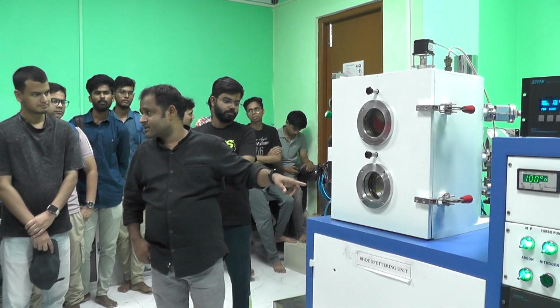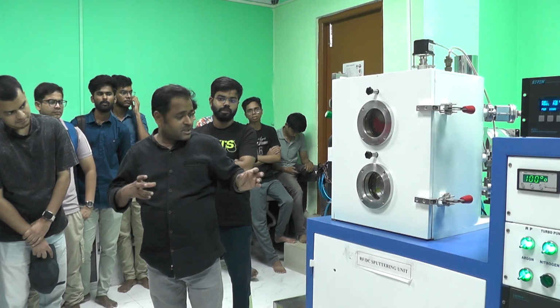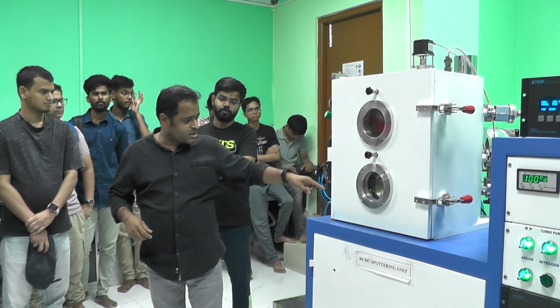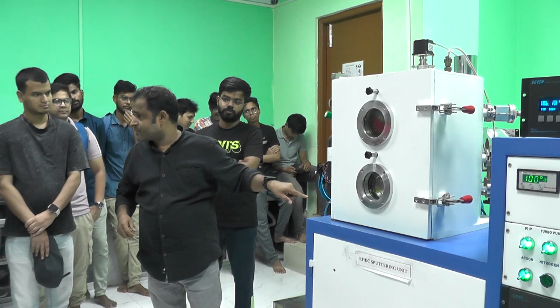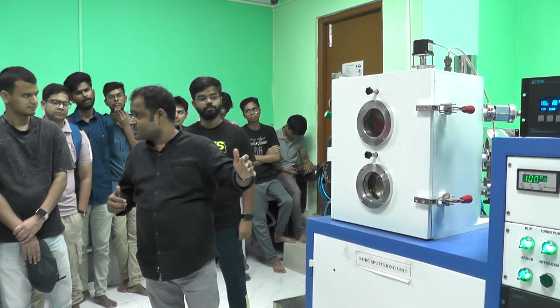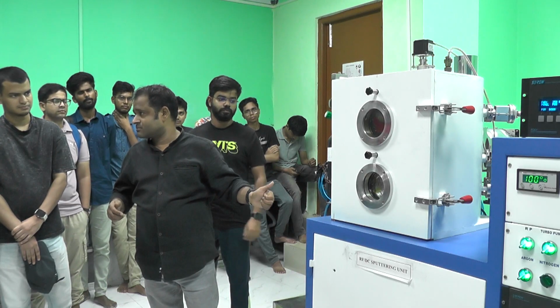And these are all MFCs, mass flow controllers. Here we can tune our gas flow rate. Like now argon is coming, so we have to set it to argon. If you want nitrogen or oxygen to pass, then we have to set the nitrogen or oxygen.